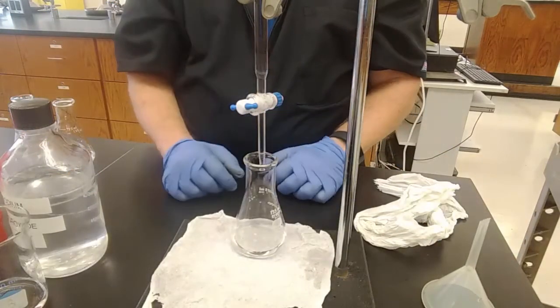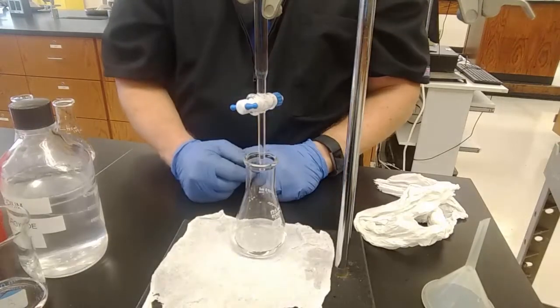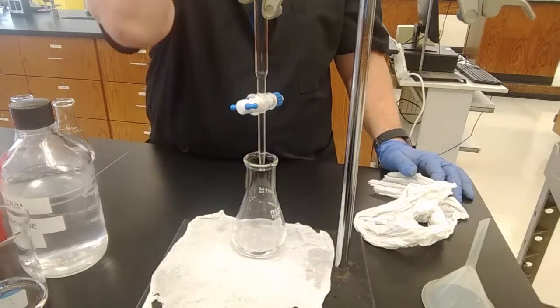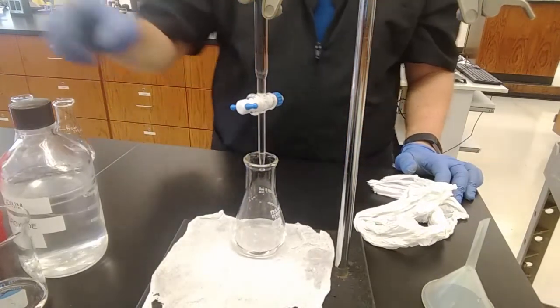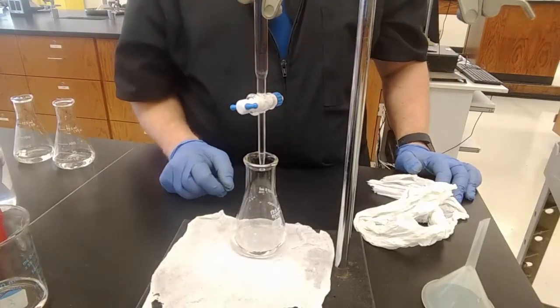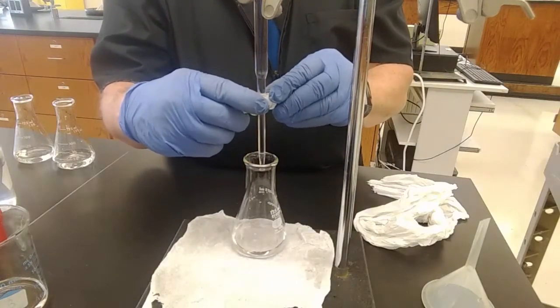Why do we use a white sheet of paper? So that we can see when our indicator changes color. All right, we have no idea where this is going to change color the first time. When we do number 2 and number 3, we will know because we will have done it once, right? We'll know how many milliliters it takes. So we're starting at 3.00, and we're going to add some base.